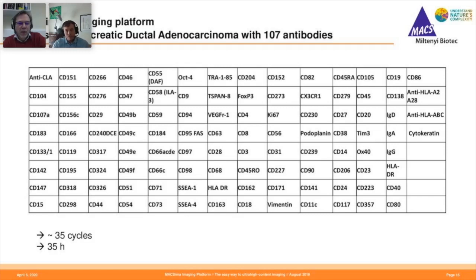This 1 hour per cycle time, what is it mostly spent on? It's not on imaging, right? Well, it depends a lot on how you define what you're doing, because that depends on the field of view you want to image, whether you want to get a big field of view by stitching together lots of images, or whether you want to do tiling. It can vary hugely depending on all these characteristics. That 1 hour per cycle is just a rough guess based on this experiment, but it can vary a lot.